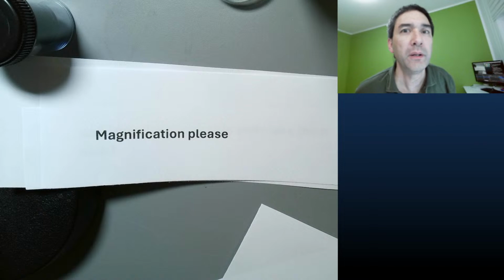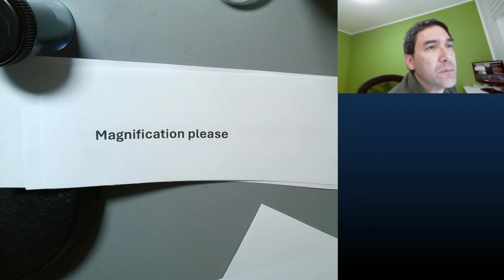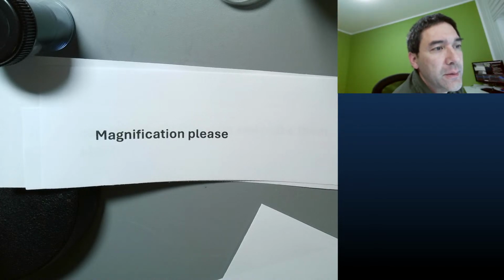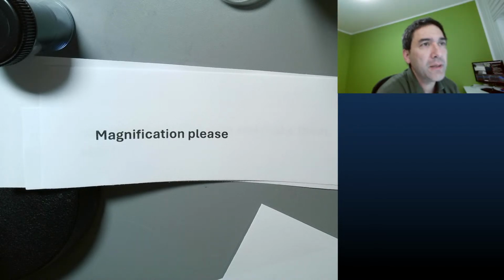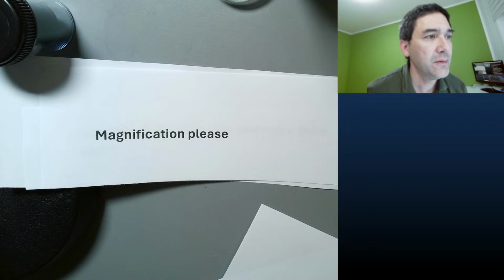I'm going to try to unplug it. Just a second. Unplugged, and I'm plugging it back again. I hope that it's able to recognize it. Still not working.